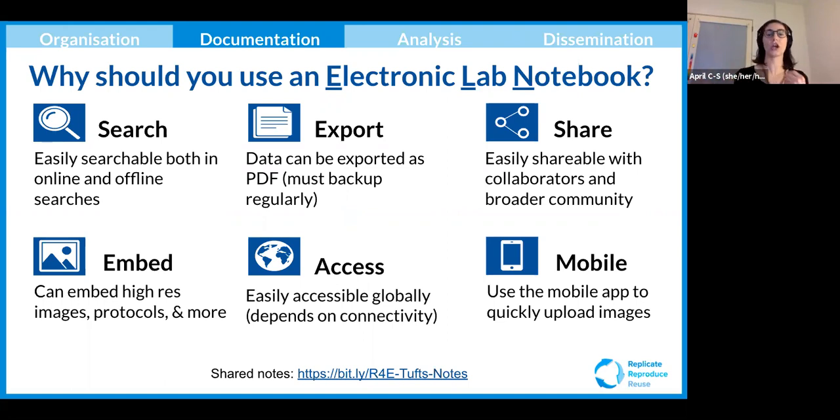So can you easily share it? Can you control permissions? Some people can change things, some people can only view things. It's a lot harder to do with a paper notebook. And some of these electronic lab notebooks can be used on mobile devices as well. So that's useful in the lab for taking photos of things. So there are other ways of documenting the work you're doing that are easier to do with an electronic lab notebook than with a paper notebook.